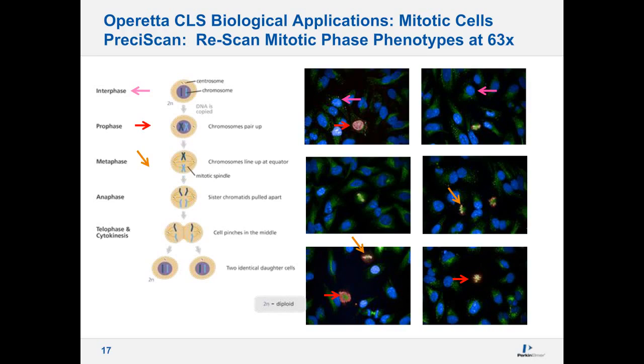We move to metaphase, where 2 cells are identified, and now we're starting to look at the band that goes across the nucleus, as shown here with the orange arrow. Then we identified 2 objects that appear to be in anaphase, and in telophase and cytokinesis, we were able to identify 1 here. So we started to have the splitting of the mitotic spindles, and finally we identified 1, as you can see at the bottom of the screen with the green arrow.